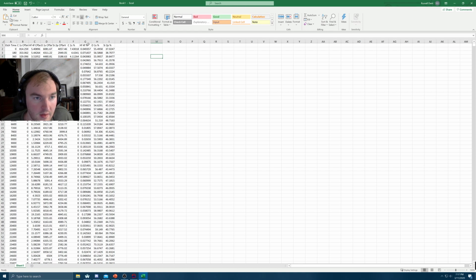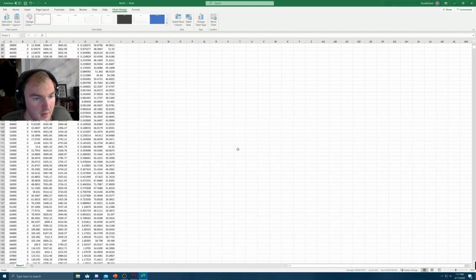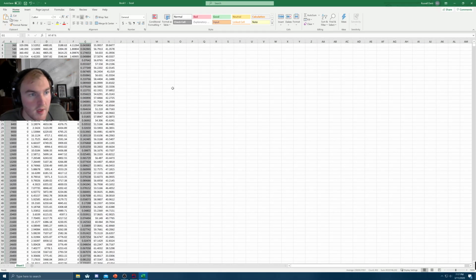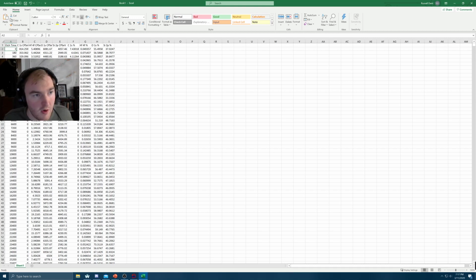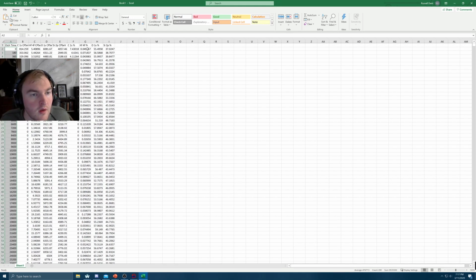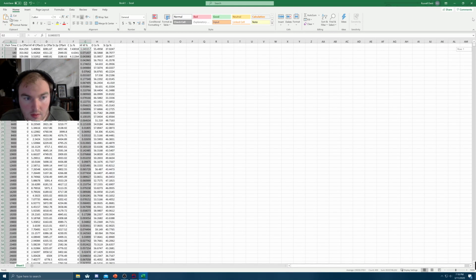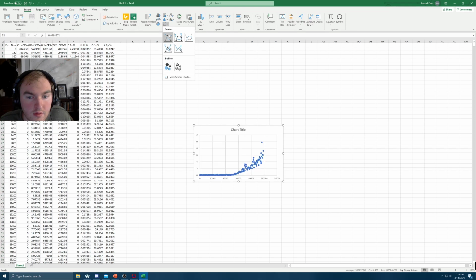So if say we want to plot the hafnium concentration as a function of etch time, we just Control click on these 2 columns. Okay, and insert, and plot, and boop. That is not working for us. Why isn't that working? Maybe we have to say, if you hold Control Shift and the down button, it'll highlight this for you. I have not ever had this issue before. And then we'll Control click here, Control Shift down. And let's see if that works for us. I may have been trying to plot zeros because it should definitely work. Insert chart. There we go.